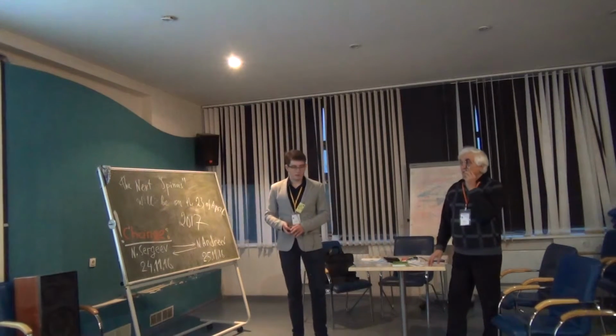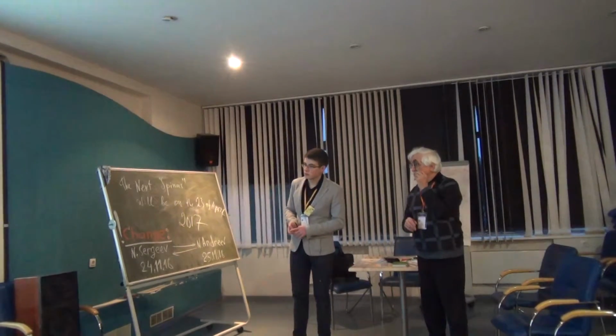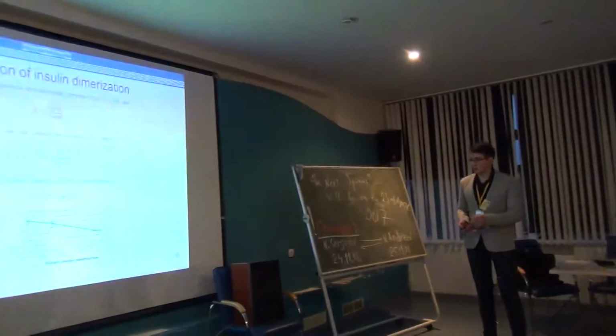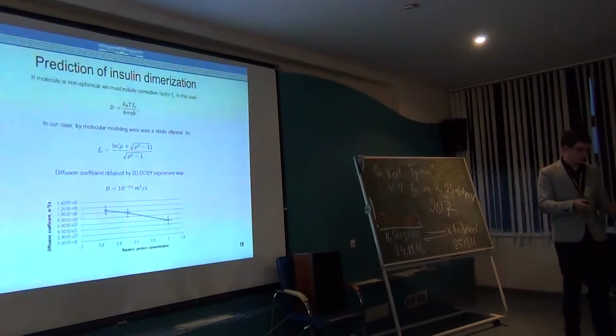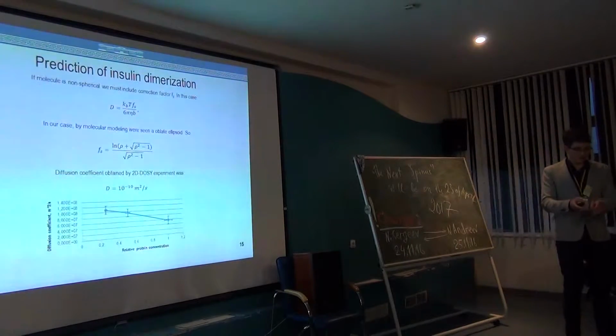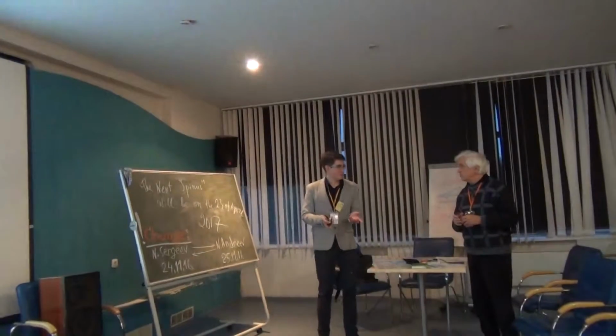Okay, thank you. Excuse me, but what does relative protein concentration mean? It was one height when we removed half and added water. Ну, то есть я имею в виду, что половину был целый столбик воды, мы половину убрали столбика и долили воды еще больше, то есть 2 раза разбавили, соответственно. То есть не измеряли, то есть качественно больше оценка.